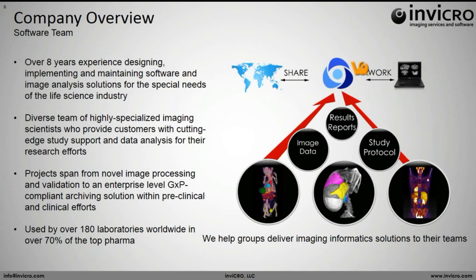So diving into the software team a little bit, as I mentioned before, we have over 8 years experience designing, implementing, and maintaining software. We have 2 software platforms: the VivoQuant, which of course you're all here to talk about today, and the iPACs, which is our data management, storage, and reporting tool. And together they truly provide an A to Z solution for all of your imaging needs.